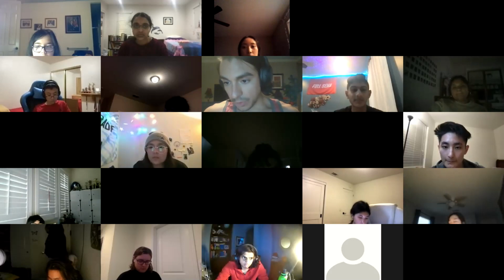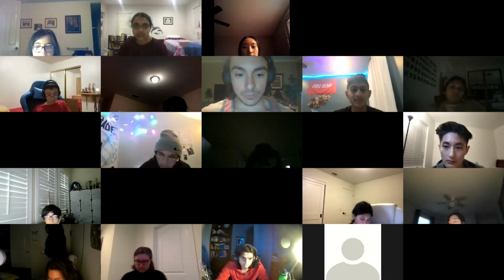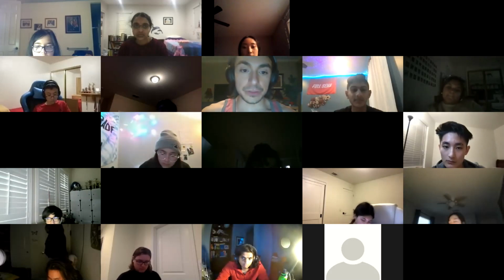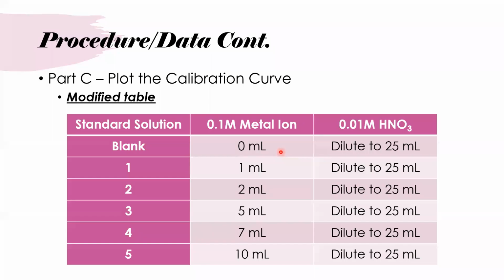Do we change the volumes in our report sheet? Yes, you do. In your report sheet, I think you have 0, 1, 5, 10, 15, and 20, right? Just change that to 0, 1, 2, 5, 7, and 10. And make sure to include that change in your calculations when you're getting your concentration.